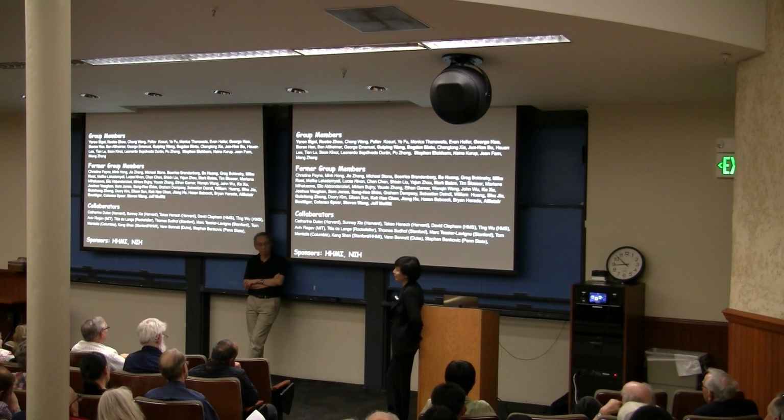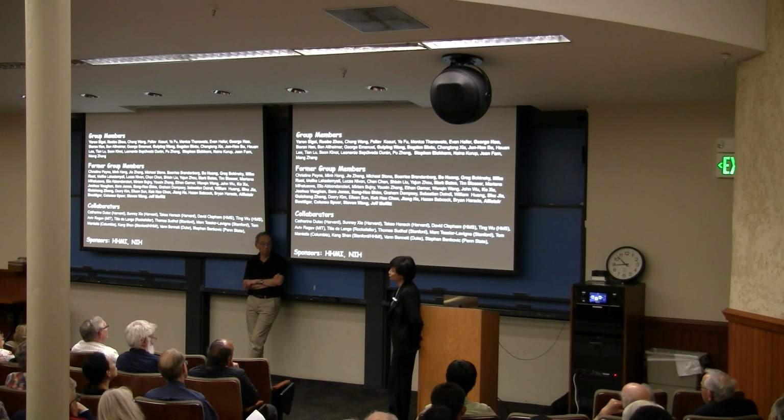Now, if you ask a different question, that is whether, not the labeling itself, but whether the fixation could perturb the structure that we study, then sometimes we also have to care about whether the fixation process has perturbed the ultrastructure that we're imaging.